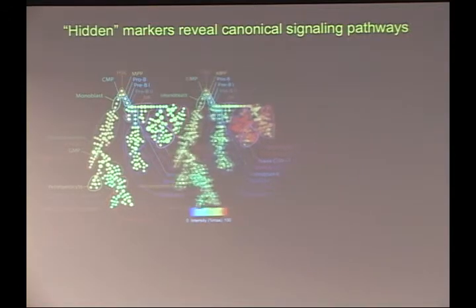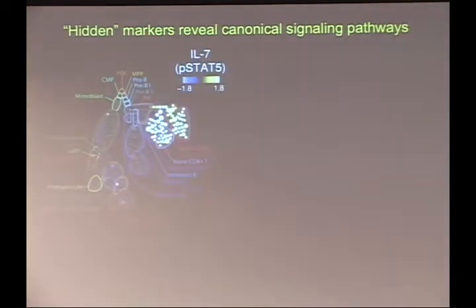Now, we can just overlay those two data sets and subtract one from the other, basically looking at fold change. And using a blue to yellow color scale, we can indicate the activated nodes here, which are T cells and NK T cells, in response to IL-7. So this is nice immunological confirmation that the nodes we call T cells and NK cells are functionally responding as those, but also, we're getting a very nice visualization technique to take a look at the signaling data.